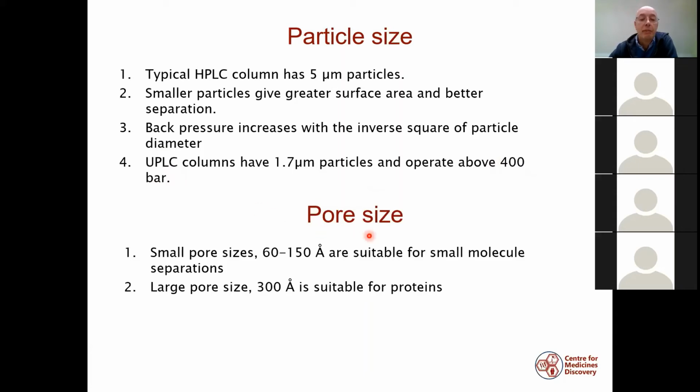Pore size is also important. So this is the gap in between the particles. The pore size, this 60 to 150 angstroms, is suitable for small molecule separations. If you have a larger pore size, this is more suitable for proteins.